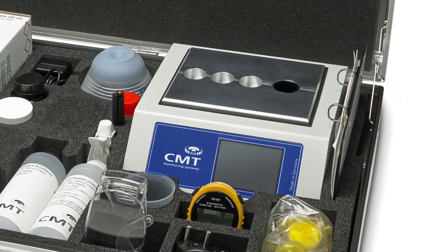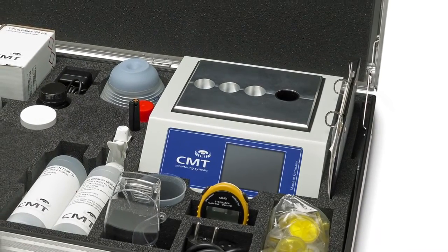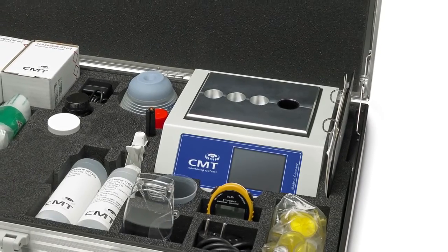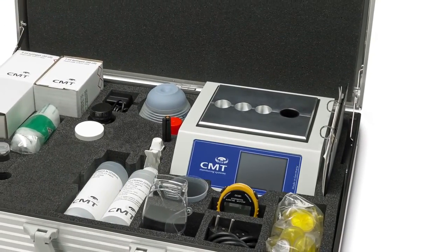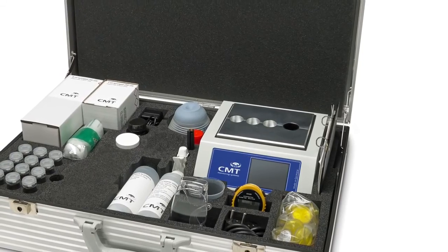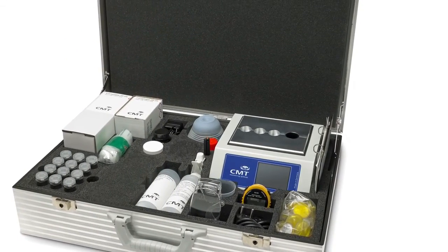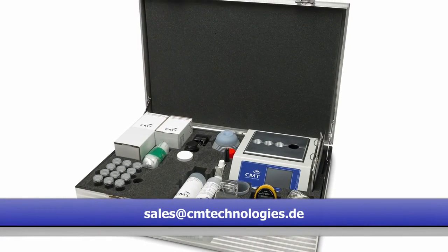For high iron readings, you can do a ratio test with a magnet holder to get the ratio between abrasive and corrosive iron. Store your readings on the device for trending or data export to a PC, following the on-screen instructions. Filters and syringes should only be used once; the vials can either be cleaned or disposed of. For any questions, please refer to the manual or contact us at sales@cmtechnologies.de.